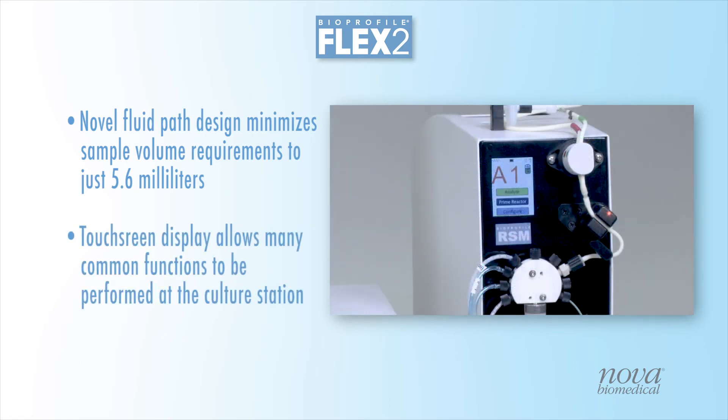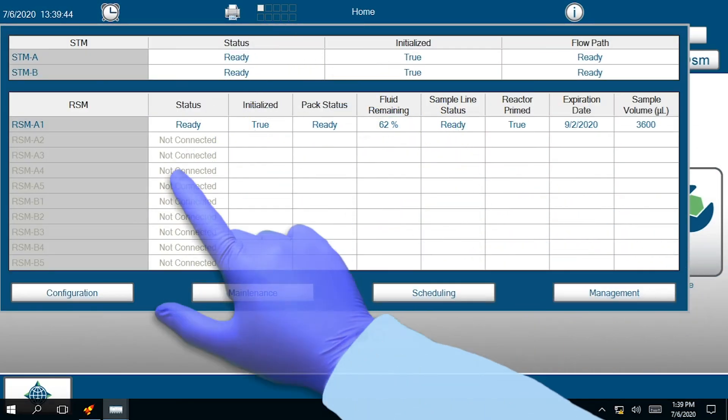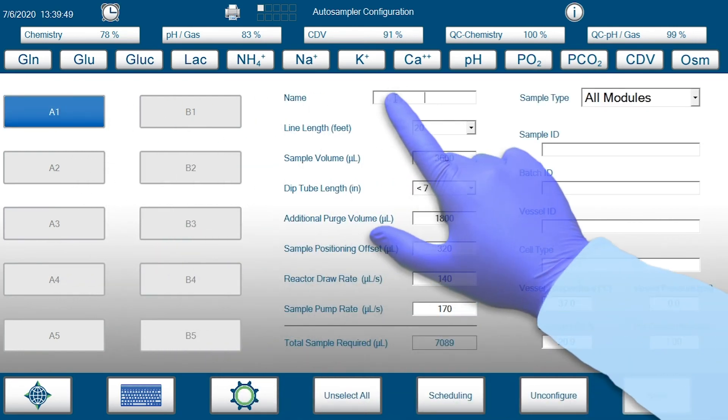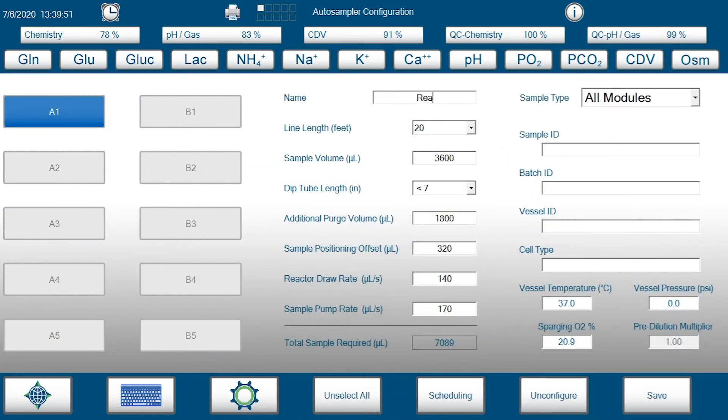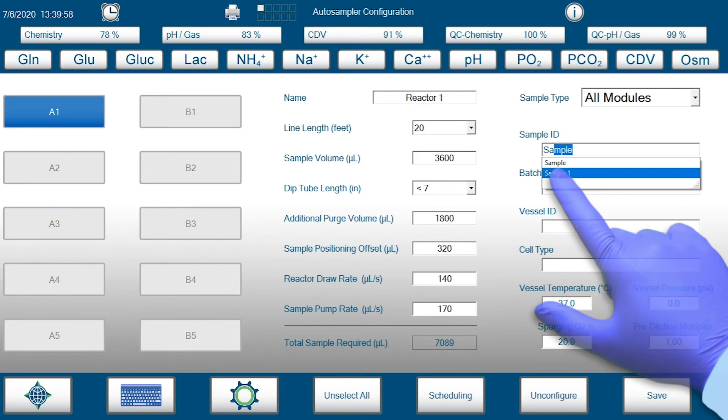The RSM also incorporates a compact touchscreen display, which allows most functions to be performed at the bioreactor. Online autosampler configuration and setup is easy via the Flex2's intuitive software and touchscreen interface. Each bioreactor can be connected and configured for online autosampling in less than 2 minutes.